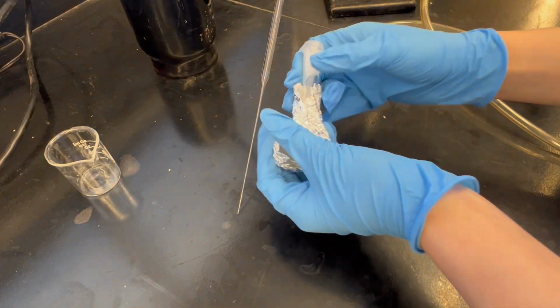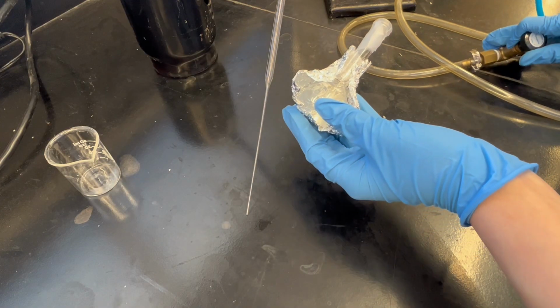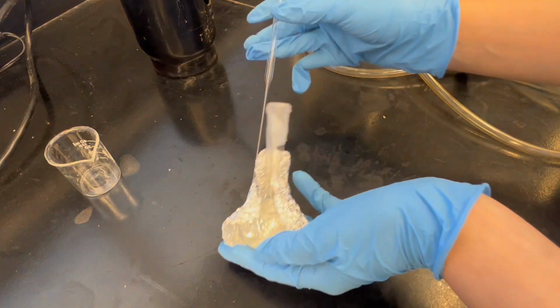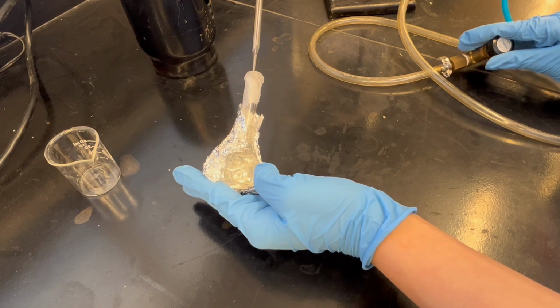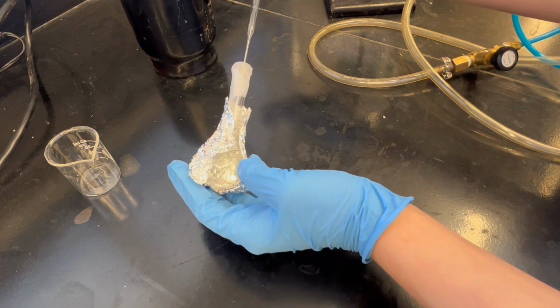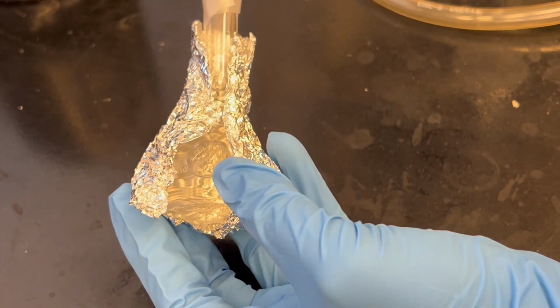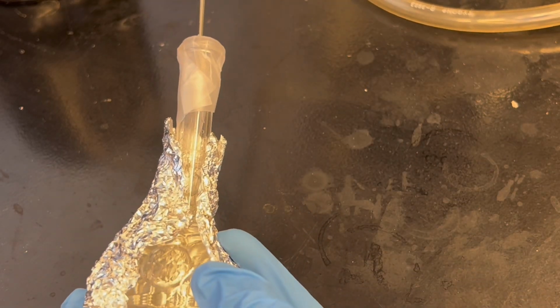And we want to keep the least contact with air, so I'll loosely parafilm it, but please leave a loose opening because we're blowing argon gas into it, so make sure the pressure in the flask can be balanced so it will not blow. We don't want it to blow too fast or too slow. Maybe 1 bubble per second, that kind of speed would be good.